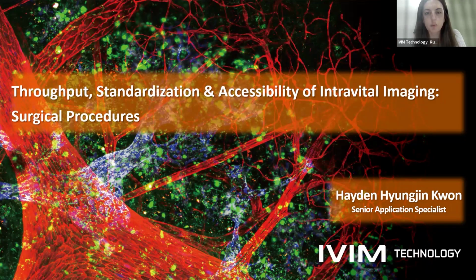In this session, we will be sharing our latest optimized intravital imaging protocols developed and refined with direct input from researchers like you. And these protocols address common challenges in intravital microscopy, such as complex surgical preparation, inter-user variability, and the steep learning curve that often limits broader adoption.